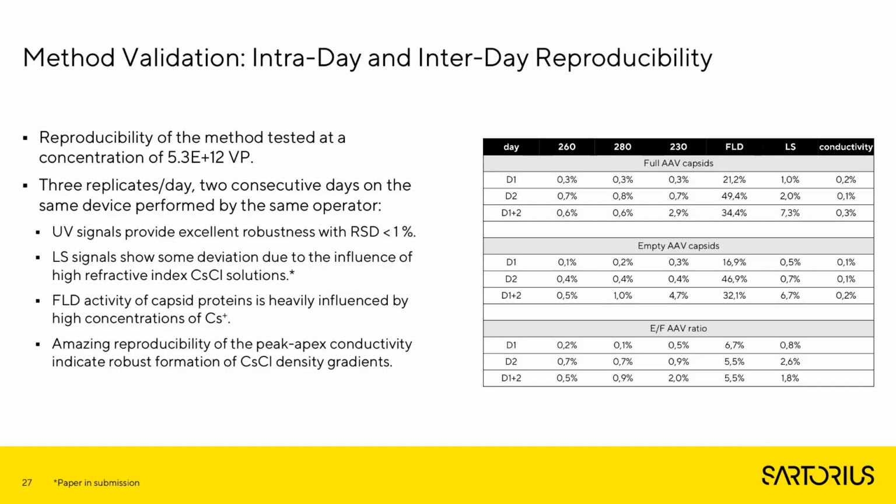We continued our validation with testing the interday and intraday reproducibility, and we were actually very surprised how robust the method is.